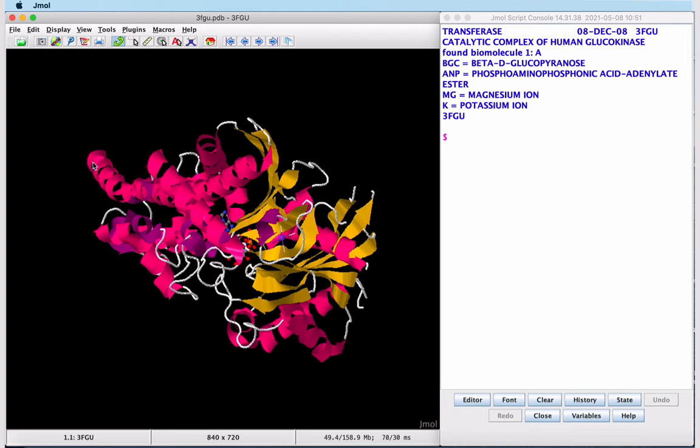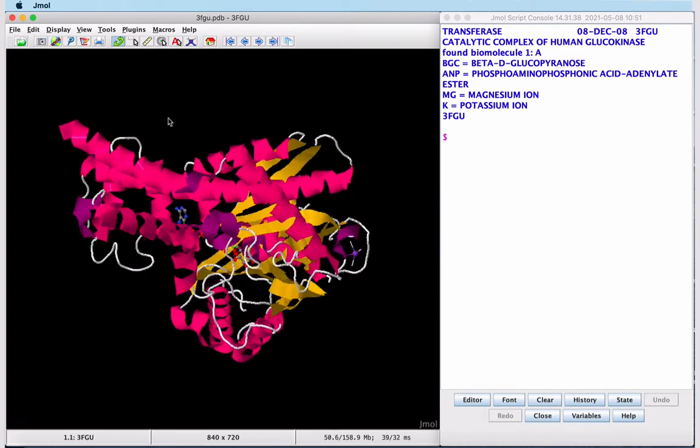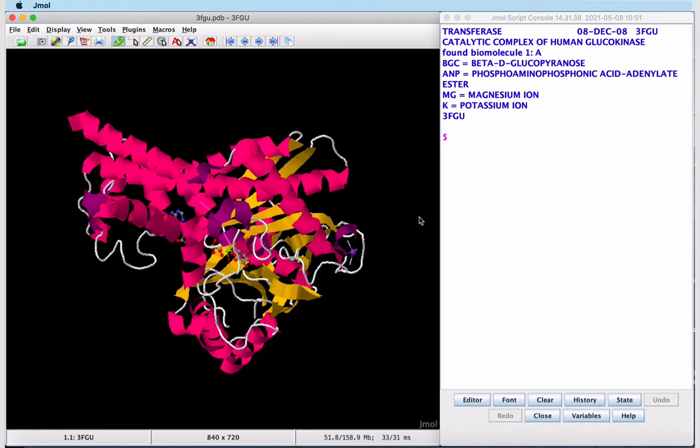When we mouse over anything in the structure, its identity pops up. All but one of the ligands are in the center of the protein. This one on the periphery, if we hover over it, we see the letter K and identify this as the potassium ion.